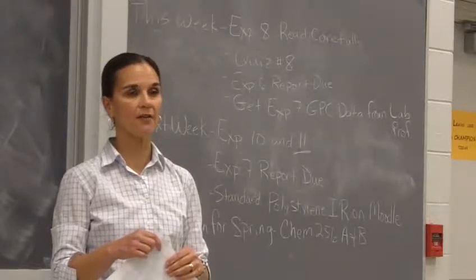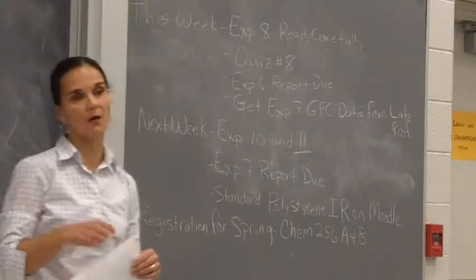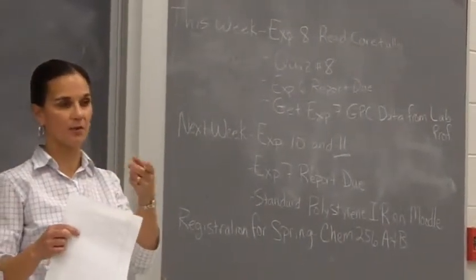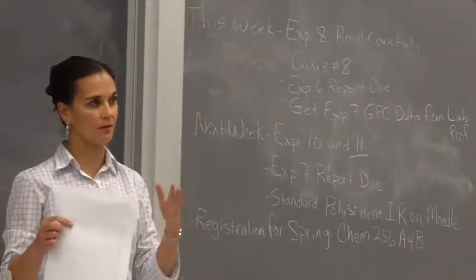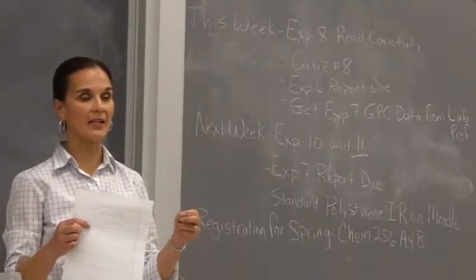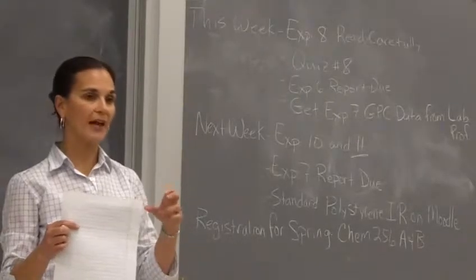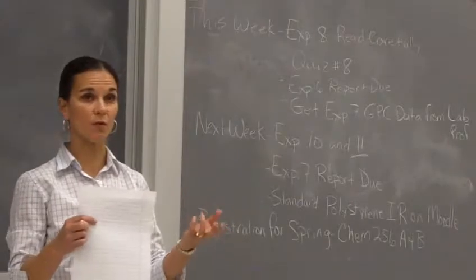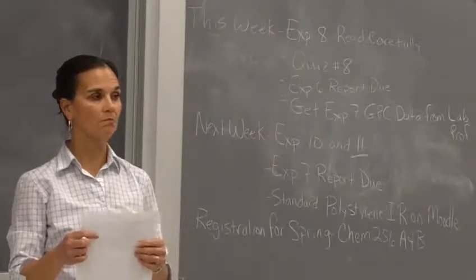We'll be working on other types of analysis of compounds, including NMR, and working towards more advanced experiments that you'll be doing in the lab manual. The second half of the semester is an optional part, Chem 256B. That is an independent project, and so the students that take that will find a target compound and propose a 3-step synthesis for that target compound, and then attempt that synthesis.